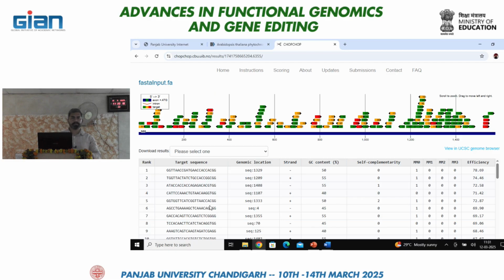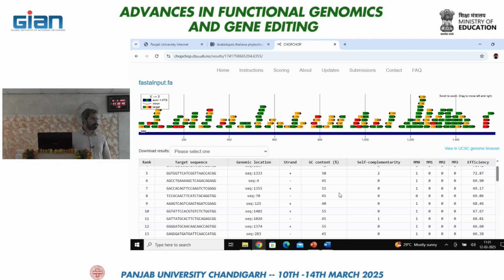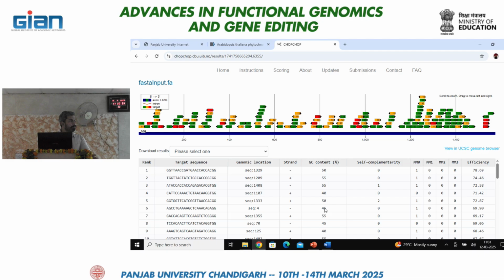No, no. It's more like when you design primers, you have to follow a particular range. It shouldn't be too high or too low, because that will hinder further steps. This will go, because this is in the range between 40 to 60. It shouldn't be too low, but it also shouldn't be too high. So this will come into the picture when we design primers. So we'll come to this.